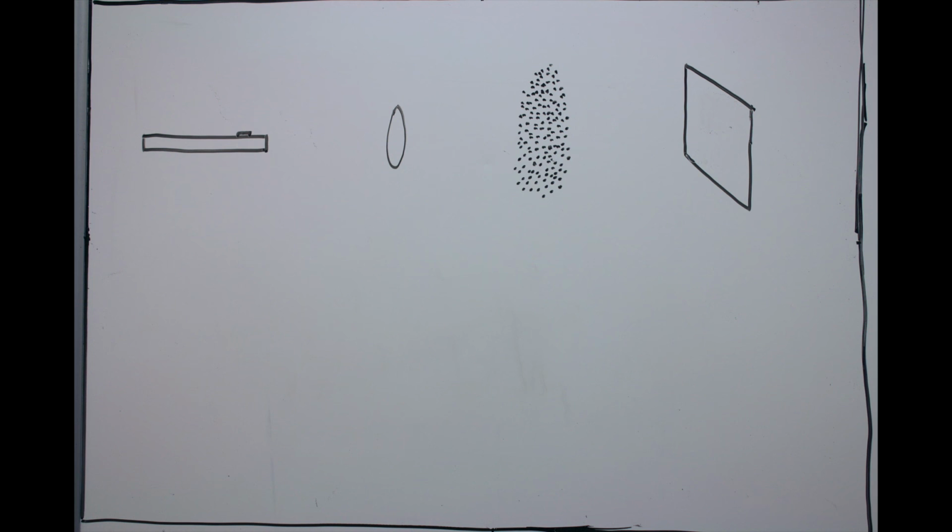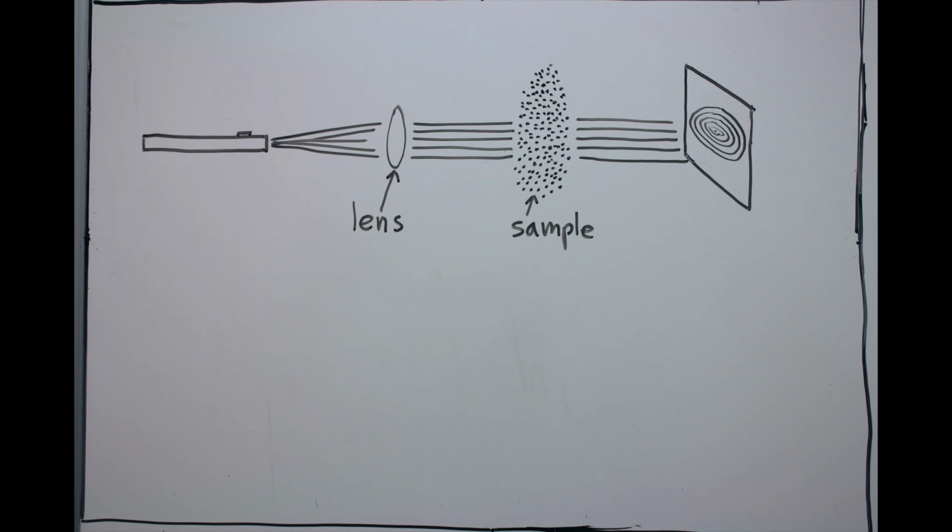Dynamic light scattering is usually used to measure particle size of materials in the submicron region. Particles that are in suspension undergo Brownian motion caused by thermally induced collisions between solvent molecules and the material particles. When the particles are illuminated with a laser, the intensity of the scattered light fluctuates over time at a rate dependent upon the particle size. Smaller particles are displaced further by the solvent molecules and move more rapidly. Analysis of these intensity fluctuations yields the velocity of the Brownian motion and hence the particle size using the Stokes-Einstein relationship.